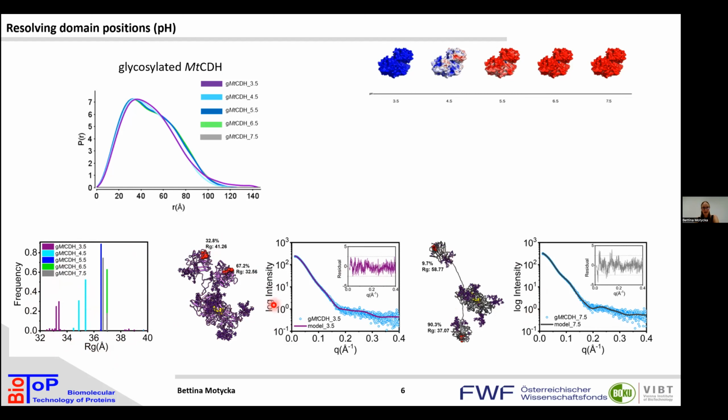And besides, I'm showing that we were using the tool MultiFoXS, where you upload your scattering data and the model, and then it really shows you how well your model is fitting, which is also indicated by the error-weighted residual difference plots. And in both cases, our models fit quite well.